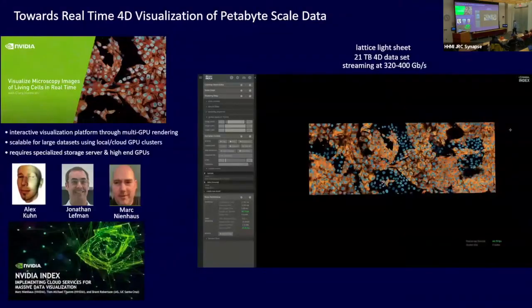Now, that's fine, but it's now processed data, but it's still bits on a disk, which isn't useful. And furthermore, if you're taking 4 terabytes per hour, you don't want to go many hours blind, not knowing whether your data that's streaming out is worth anything. So you need some kind of real-time visualization. We've been working with NVIDIA, who has developed this IndeX platform, a multi-GPU solution that allows you to do real-time manipulation of the data. If my movie would play again, you could see that.